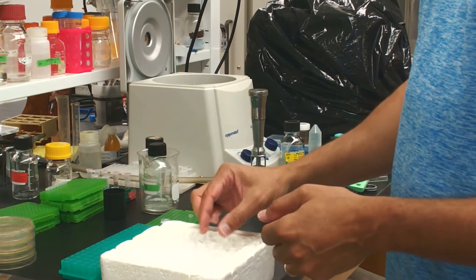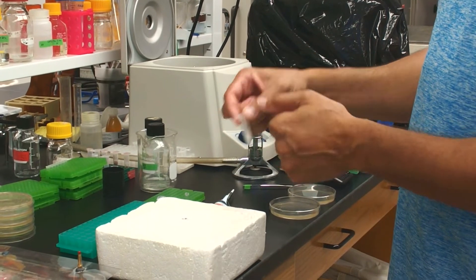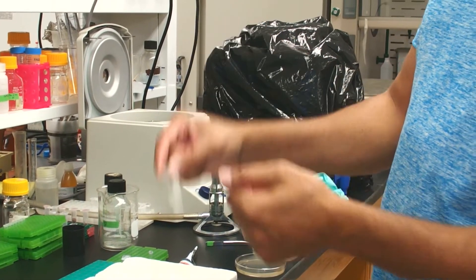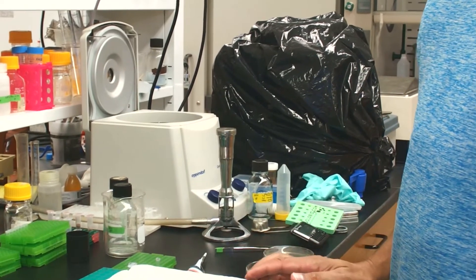These competent cells have been made by the Inoue method, which produces ultra-competent cells. Once the DNA has been added, you're going to flick the tube slightly like this to mix the DNA. Now they're ready to be transformed.